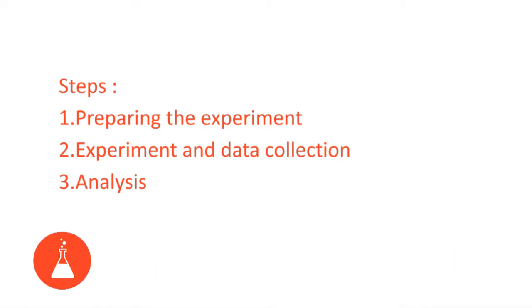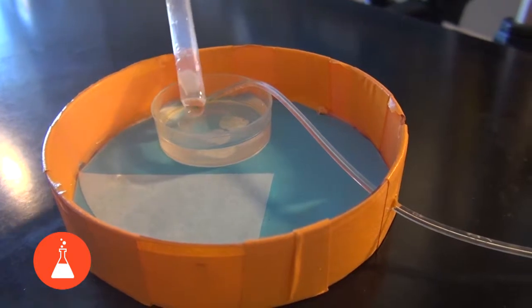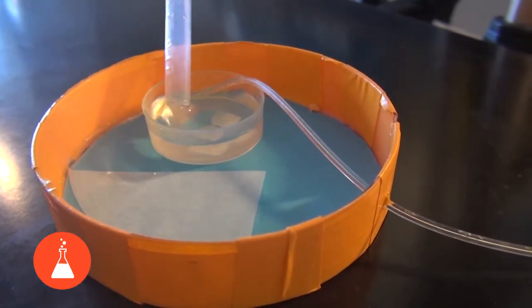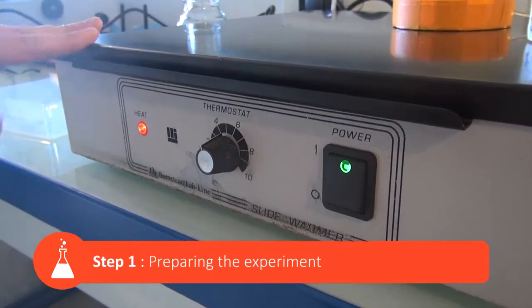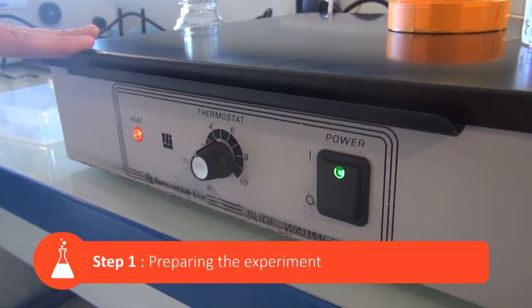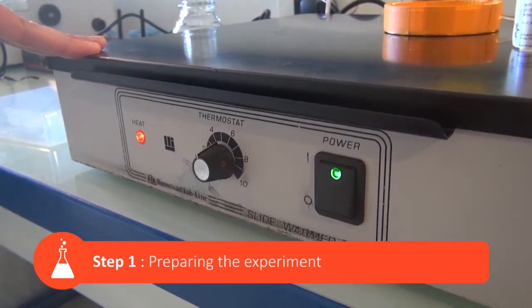Also, calcium imaging allows recording the activity of hundreds of individual neurons at the same time. To do so, we submerge brain slices in a fluorescent calcium indicator, Fura-2AM. We start by switching on a hot plate, which will maintain brain sections at a temperature of 30 to 32 degrees Celsius during incubation.